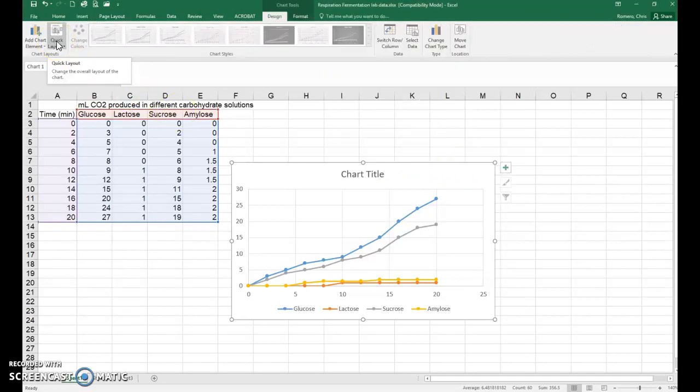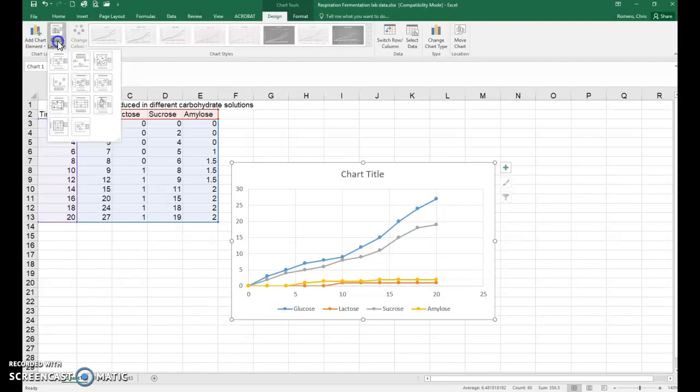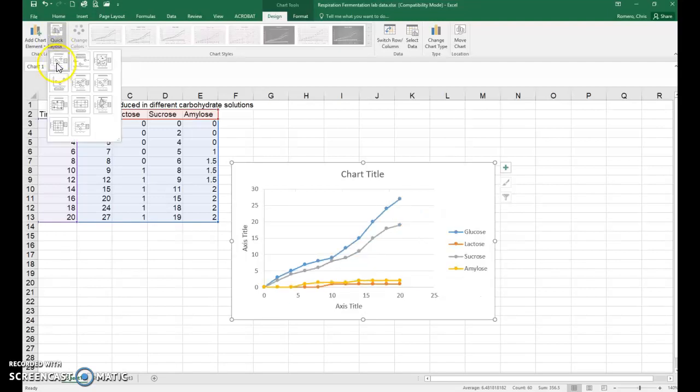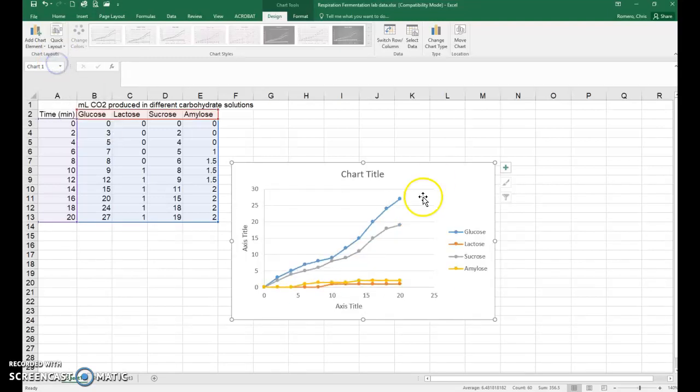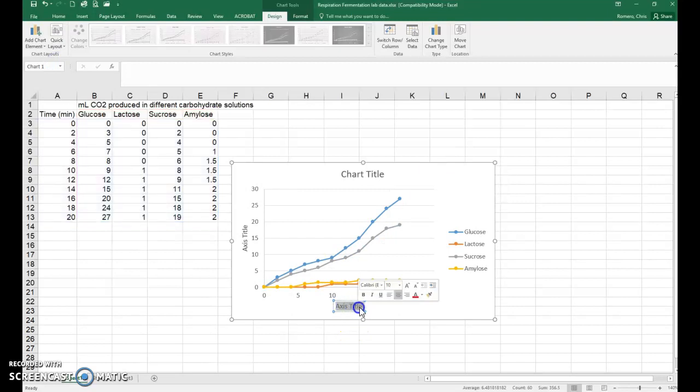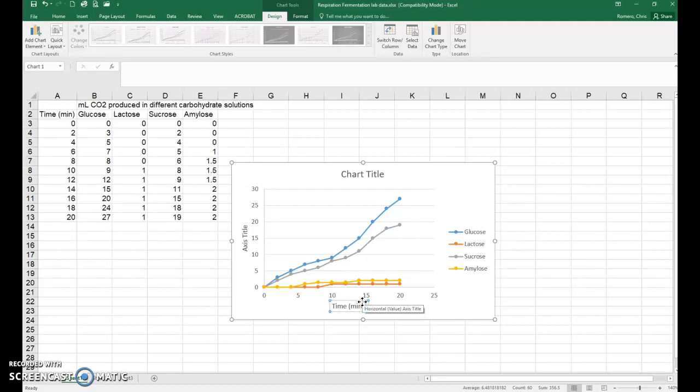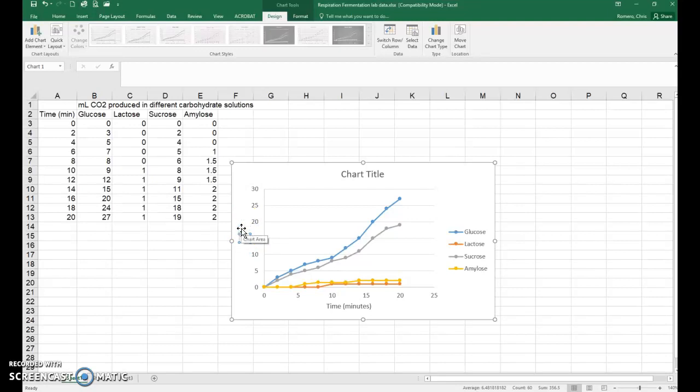Go up to quick layout in the upper left up here, click on that, pick the first option and then we'll enter our axis title. So your x-axis is time in minutes and your y-axis is going to be milliliters of CO2.